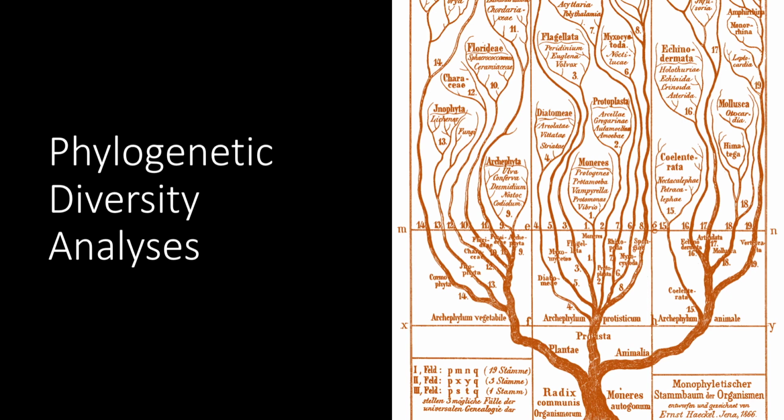Now, what's really great about QIIME 2 is it makes the phylogenetic diversity analysis fairly simple. What that means is that we're going to be taking into account the different distances between each sequence, so each ASV. Those differences can indicate something about the function that the bacteria might have, and can tell us a little bit more about how diverse our samples are, right?